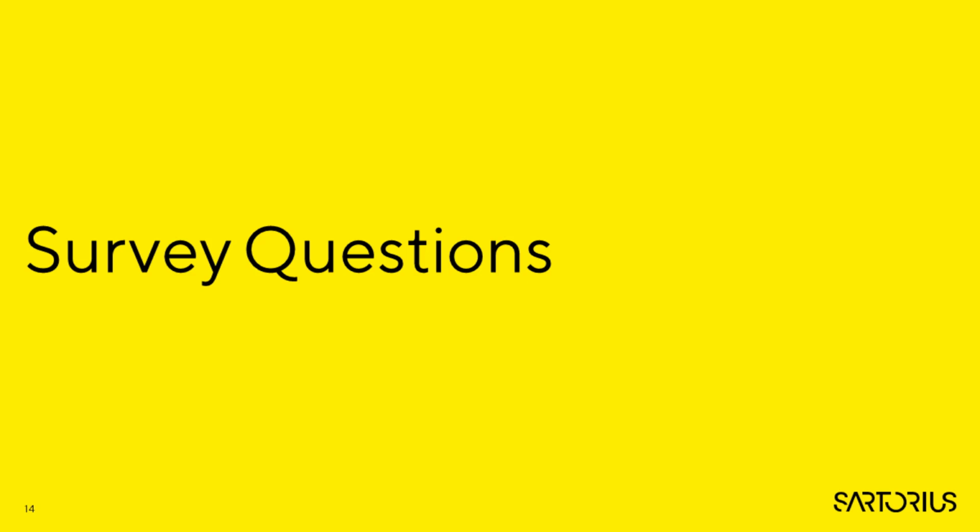And do you use parallel mini bioreactor systems? Already using, would love to get started, or not planned? And are you employing a method for product titer determination? Protein A, HPLC, octet system, or ELISA, or other? And finally, what are your main pain points in titer determination? Low throughput, suboptimal accuracy, unspecific binding, cumbersome sample preparation, or other.